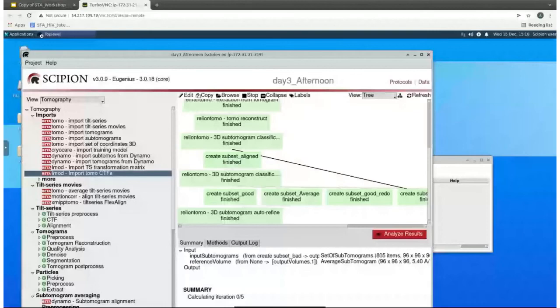Ana, there are 10 classes, so what happened? I'm not an expert in this area, but what if you reduce the number of classes? Wouldn't the right ones be together, or it doesn't make sense? Instead of asking for 10 classes, just asking for... I will do the opposite, Pablo. I will ask for more classes, and maybe that will split more and then get more. But it really depends. Each classification is different, so normally in real life you need to run several classification steps to get a good result. I see. Thank you. As we are doing now with the other one.